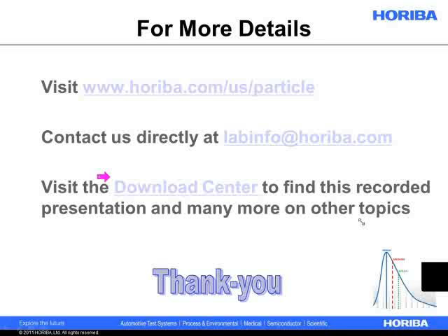It may be the mode, it may be the median. I forget which off the top of my head. Bill is saying it's the ratio of the two modes. I'll take your word for it, Bill. I'll have to check after the presentation, but it's really not the aspect ratio. It's really just more of like a volume percentage.